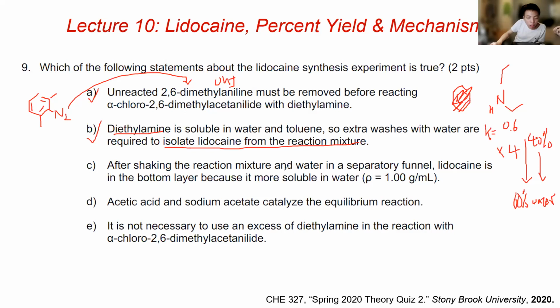After shaking the reaction mixture and water in a separatory funnel, lidocaine is in the bottom layer. No, lidocaine is soluble in toluene.